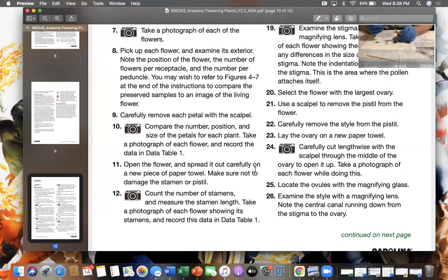Okay. So you have these darker ones on the outside, then you have these thinner petals. Okay, we're getting towards the middle now. I think probably the lily is going to be the best one to deal with. Ideally, we would have two forceps here.